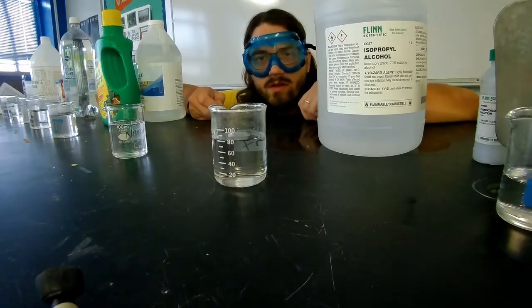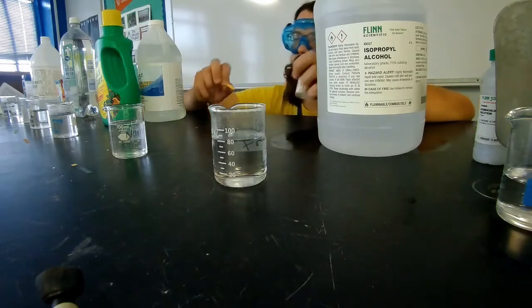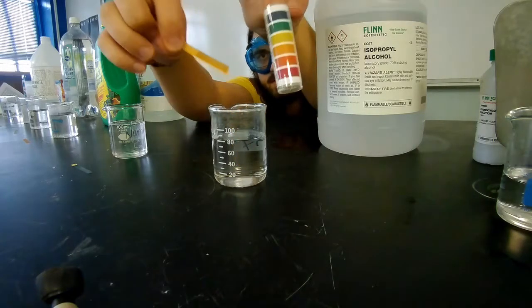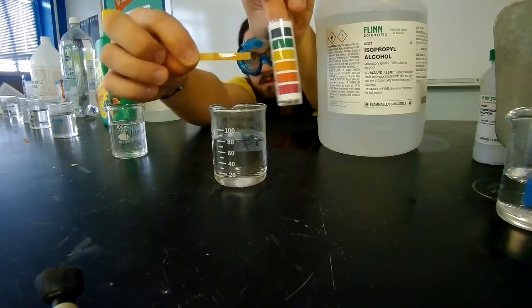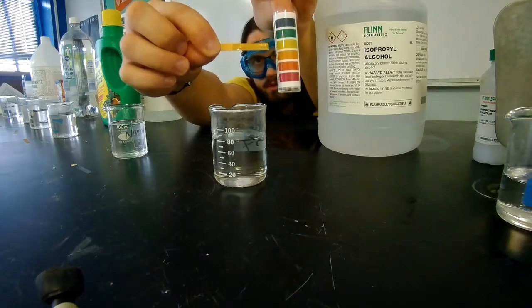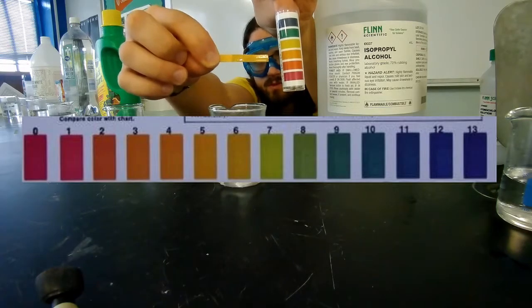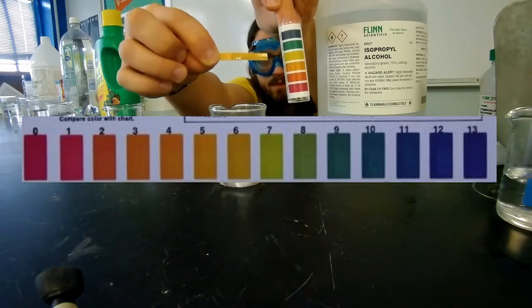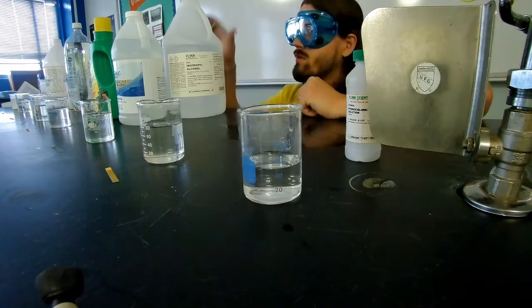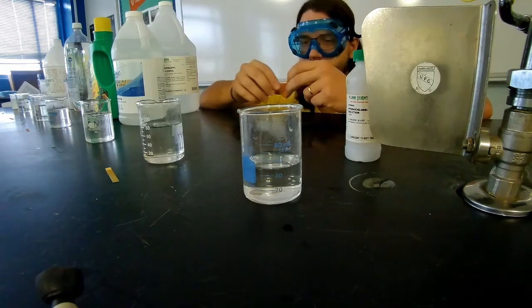Alright, next we're moving on to alcohol. What do we think? Let's see what happens. Dunk it. Not too much there. So what do we think? Acid, base, neutral? What's the pH? Alright, and we're running out of room a little bit here on the edge of the table.